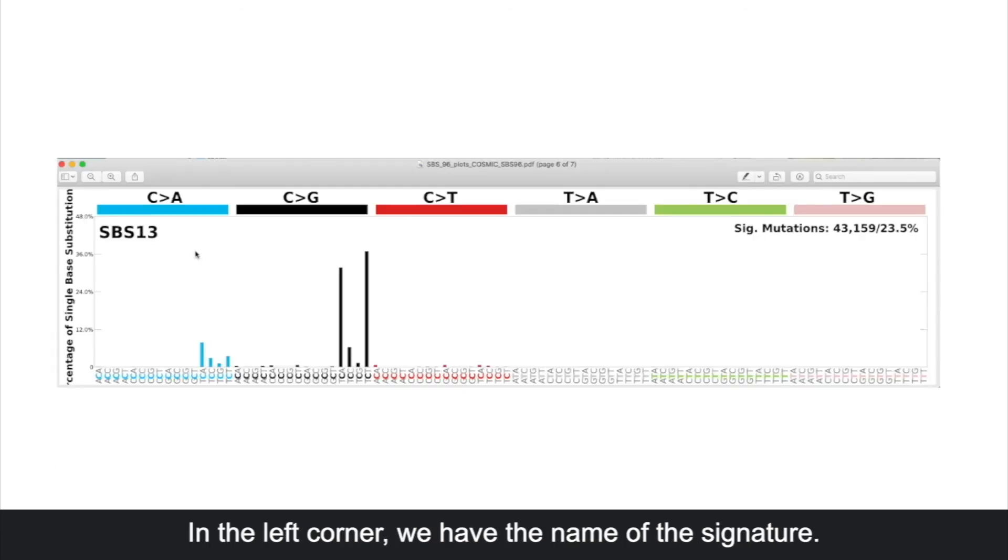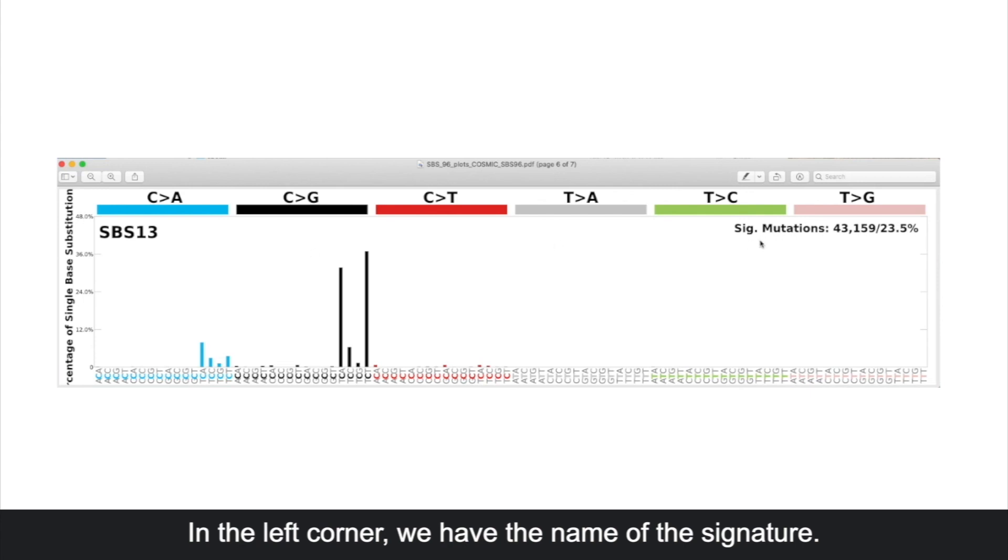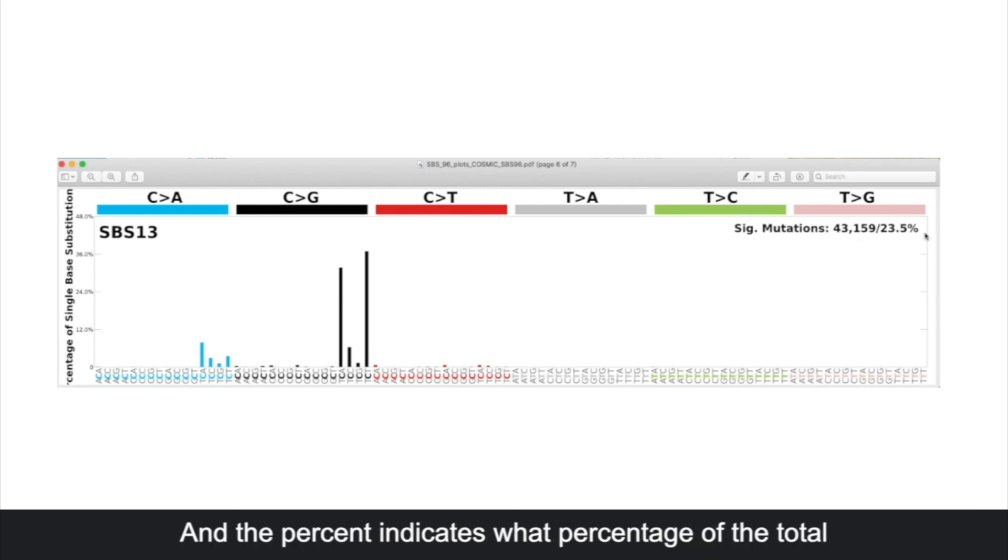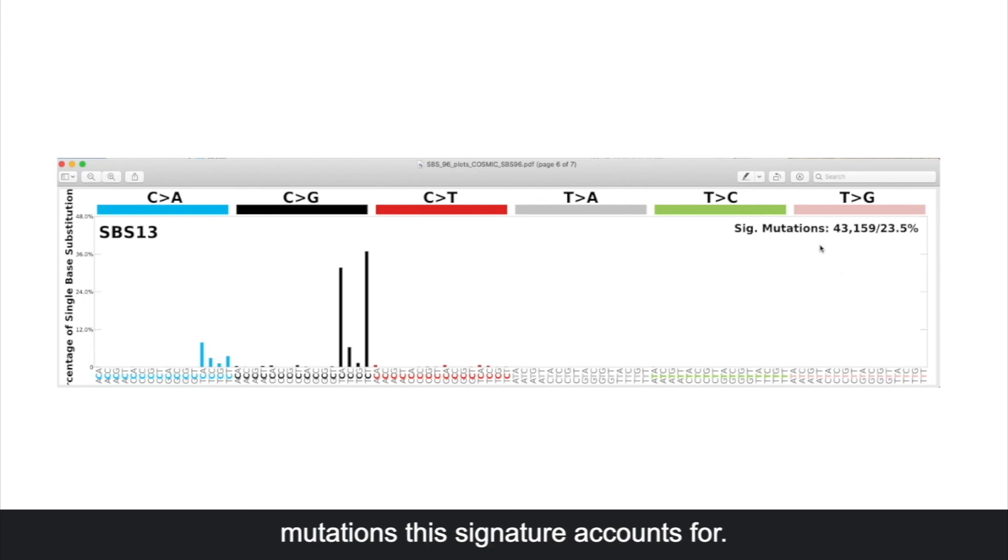In the left corner we have the name of the signature, and in the right corner we have the number of mutations for this signature. The percent indicates what percentage of the total mutations this signature accounts for.